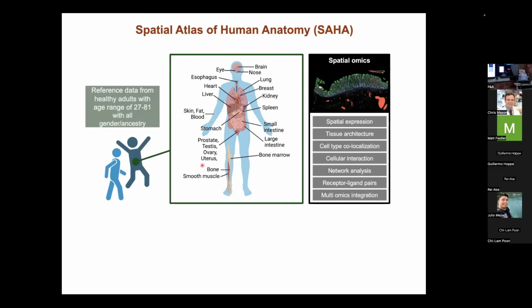So that single cell would be its own group. If you keep going down, unless you start going really fine, you'd see hard demarcations at the protein and RNA level that break it up into 7 groups. But if you're going to ask me the computational method that we use, that would fall more into Chris's bucket than mine. No, okay, that makes sense.